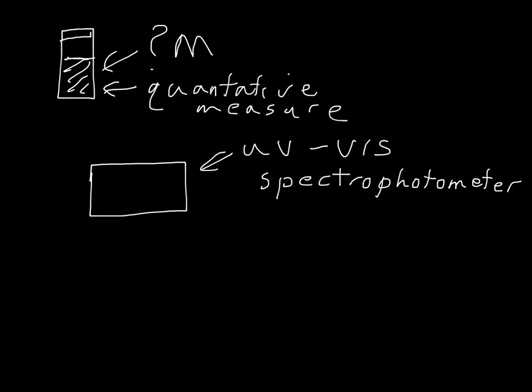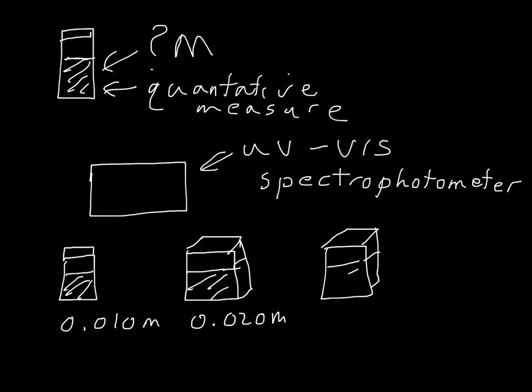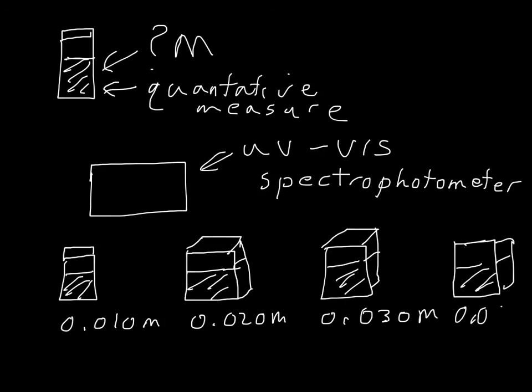These samples would have different concentrations. In other words, I'm going to make some standards. So I'm going to make some samples whose concentrations I know.